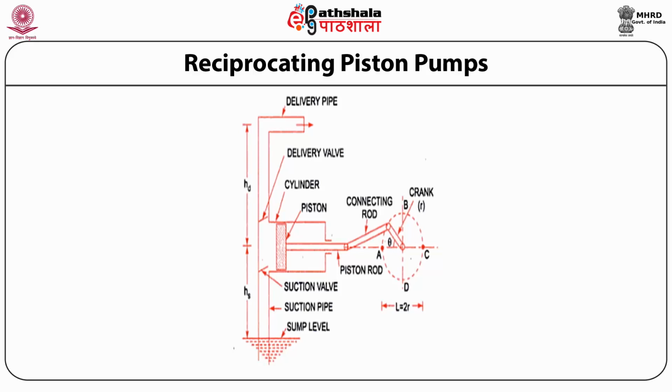These pumps are advantageous because their solvent delivery is smooth, constant flow rate can be achieved even at high pressure, and supports gradient operation. There is no limitation of reservoir size or operating time. In case of minor pressure pulses, dampening may be required.